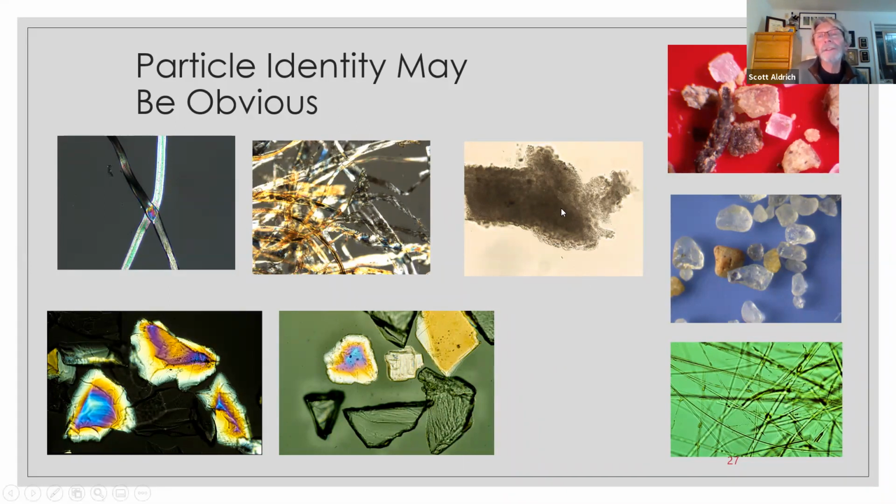And you can see that it's not completely homogeneous. There's little speckles in it from the carbon black they use to color it. In the upper right, this is some solids from a spice mixture. There's some salt grains and pepper and other items from the herb mix.